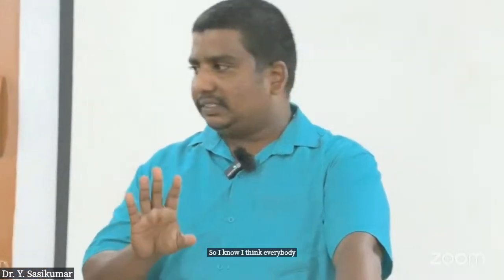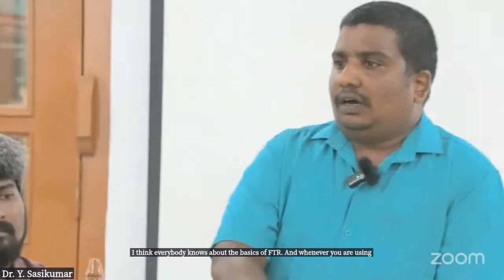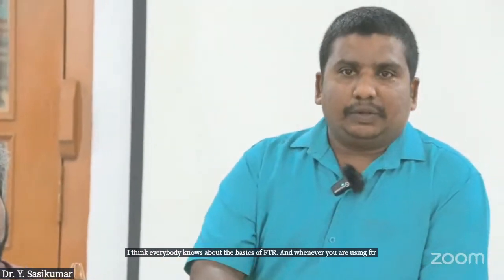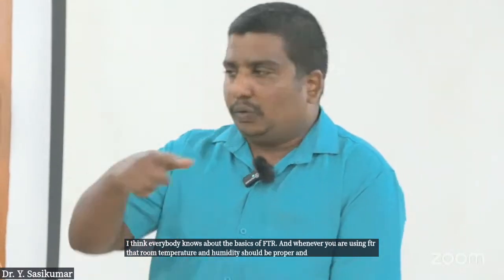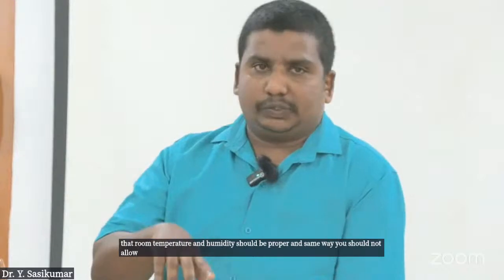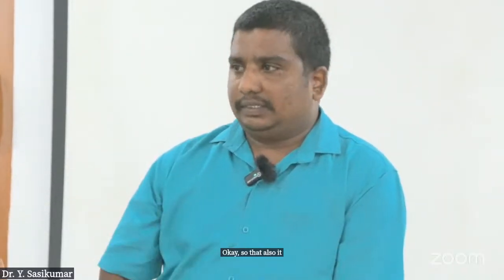I think everybody knows the basics of FTIR. Whenever you are using FTIR, the room temperature and humidity should be proper. In the same way, you should not allow lots of people around the instrument, as that will also impact your results.